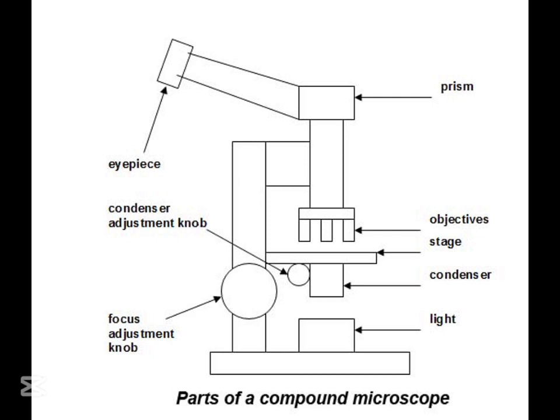All right, so we've mastered using a microscope, but how does magnification actually work? How can it make something appear hundreds of times bigger? It's all about light, how lenses bend light. When light passes through a curved lens, it changes direction, and this bending of light is called refraction. Refraction, got it. It makes the image look bigger than the actual object. So the more the light bends, the bigger it looks. Exactly. And microscopes use multiple lenses to bend the light in just the right way to create a super magnified image. So it's like a chain reaction of magnifying.